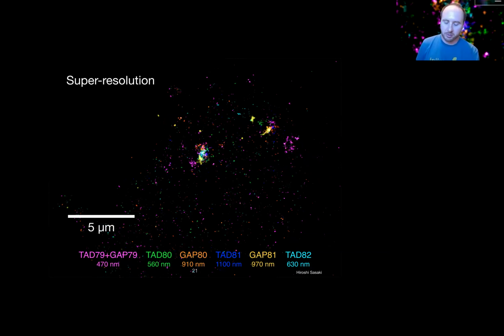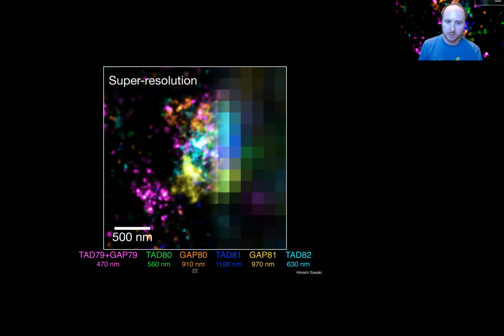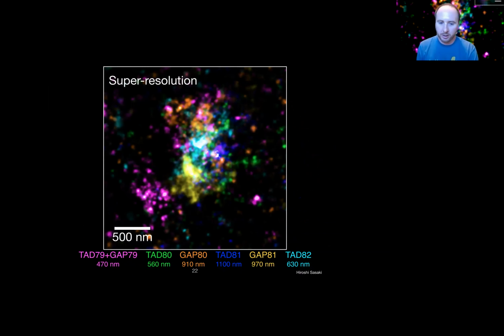And then this is what the super resolved version of that would look like. So we get a little bit of both alleles, but the one in the center is the one that we really focused on. The other one's a bit out of focus. So to show you what we can get out of this, of course, you have to take it and make it bigger. So this is just that focus in the middle. And then if we zoom in and look at the 6 color, this is what you see. I personally never get sick of looking at these. As some of you may have noticed, this actually is my Zoom background I'm talking in front of right now. It comes from this image.